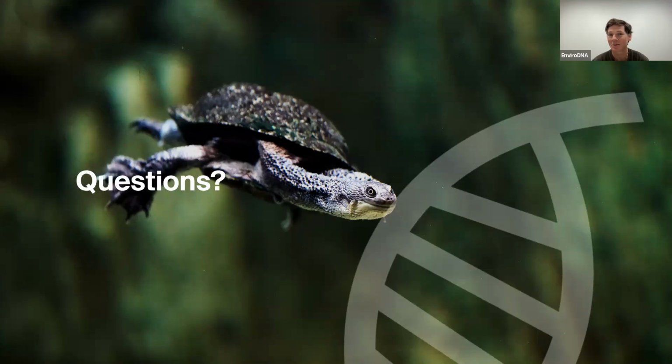That will enrich the usefulness of your data. Sampling things that they are maybe eating, whether that's bones. We were able to get predator identifications from prey items, or from plants that things may be browsing on. Really, the list is endless, but it really depends on the effort that you're able to go to in sampling, of course. So that's very much a contingent kind of answer depending on the target.